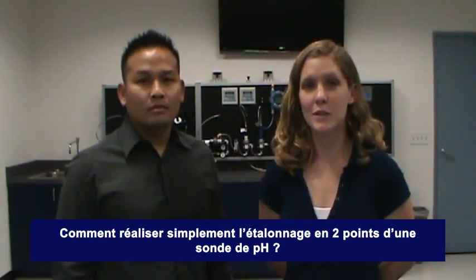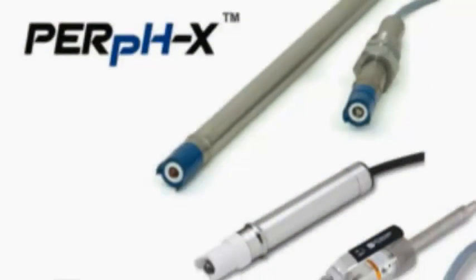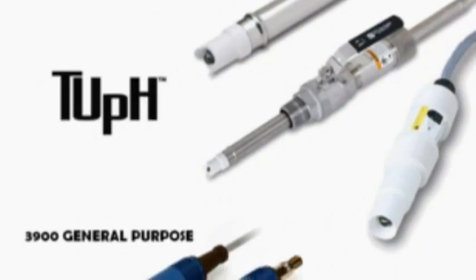Today, we are going to show you how to do a two-point calibration on a pH sensor. All of Rosemont Analytical's high-quality pH sensors can be calibrated the same way.